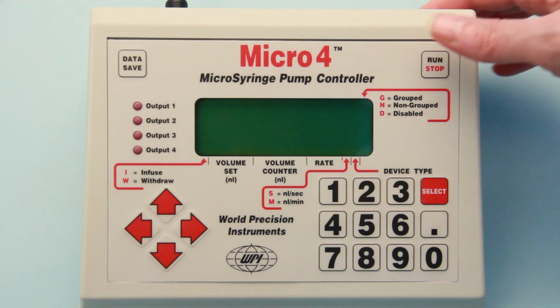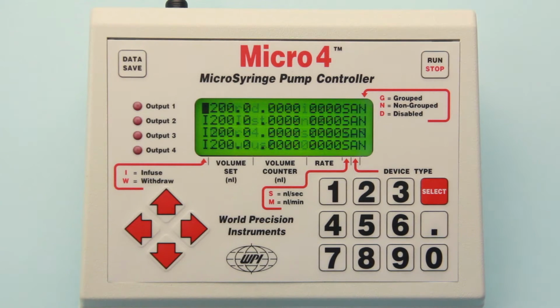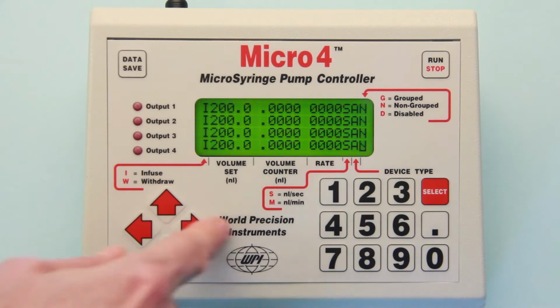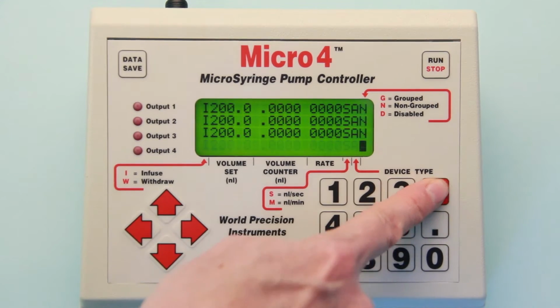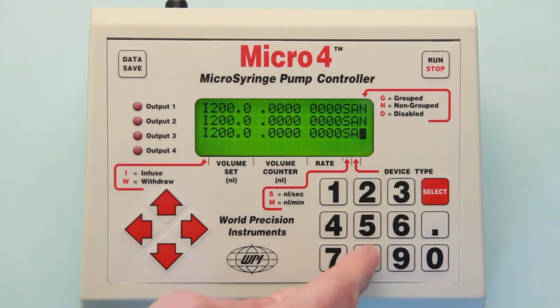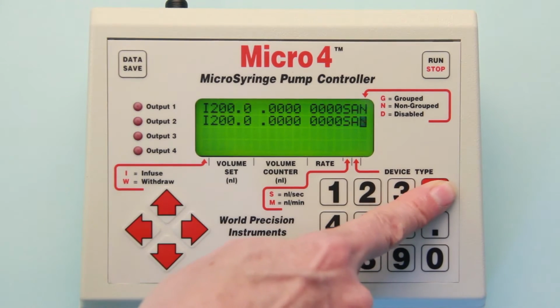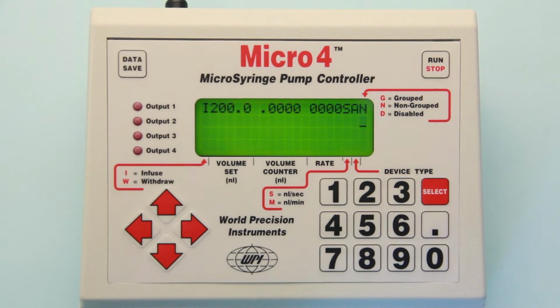The Micro4 control panel lets you set all the parameters of your injection setup. Each line on the LCD display shows the parameters for a syringe pump on that channel. Let's disable the channels that we're not using to simplify the display. Use the arrow keys to move the cursor to the far right. Press the Select button to toggle the desired settings: N for non-grouped, G for grouped, and hidden when disabled.